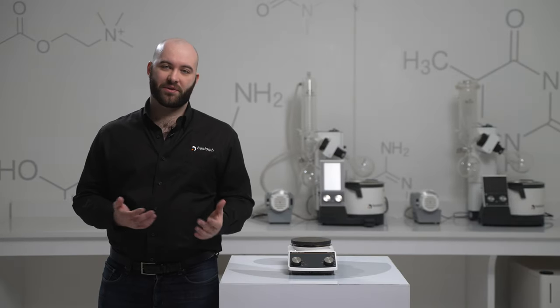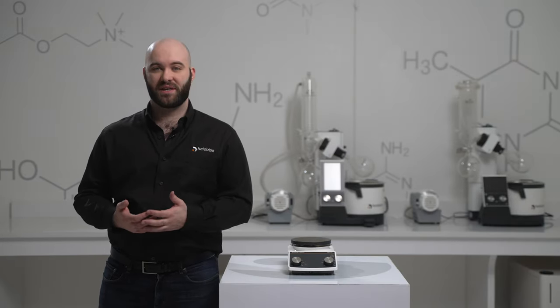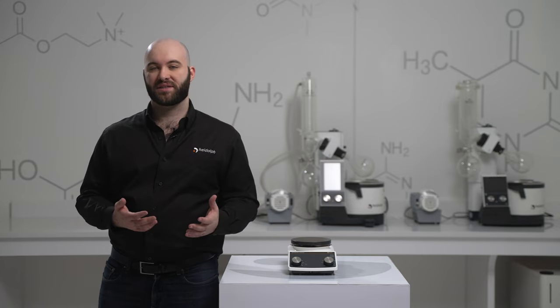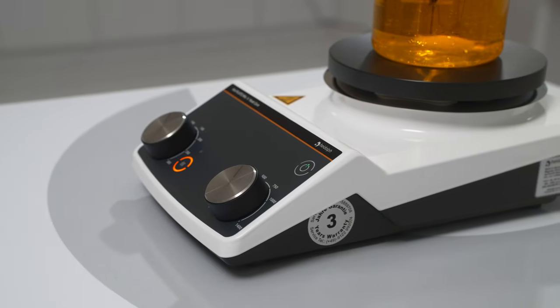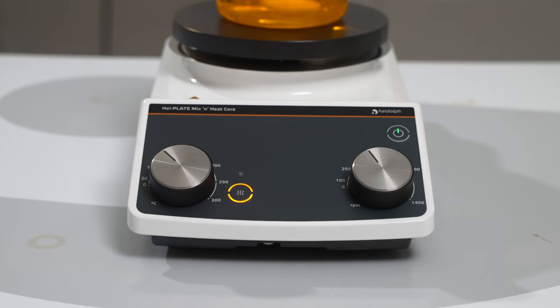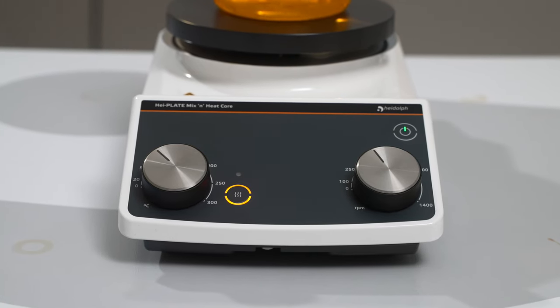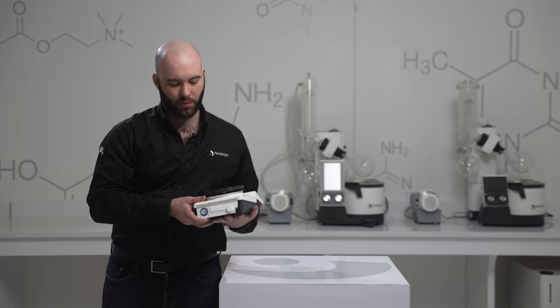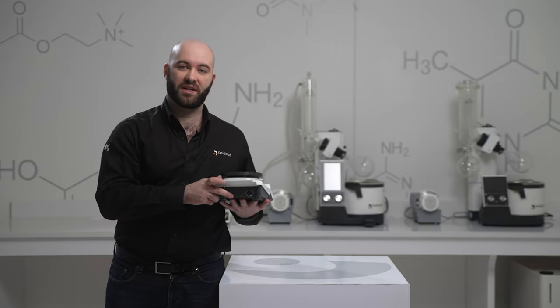The next hotplate that received an update is the hotplate mix and heat core. This is replacing the high standard. It received all the standard lineup updates similar to the hotplate mix 20L, in addition to having the PT-1000 probe replaced with the EKT HiCon.